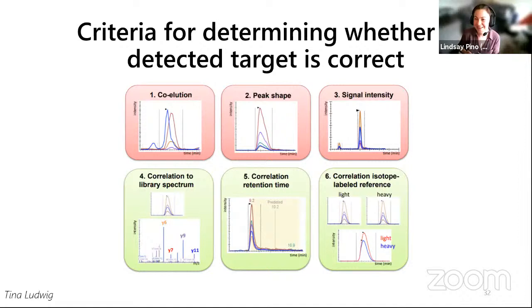Yeah, I think Juan's going to get this question from Hugo on acceptable value for a dot product. The short version is, it depends. Higher is better, but there are a lot of reasons why you might get a low dot product, a poor dot product, but it's still the right match.